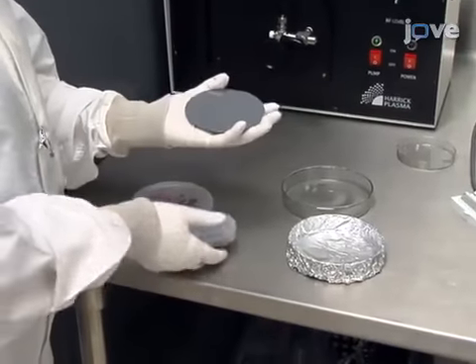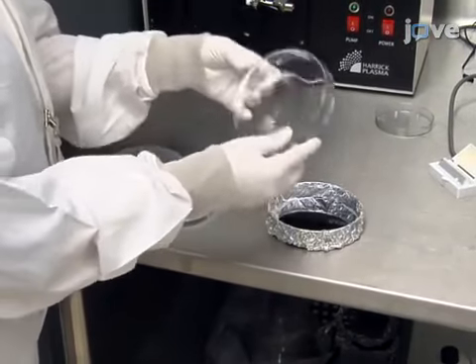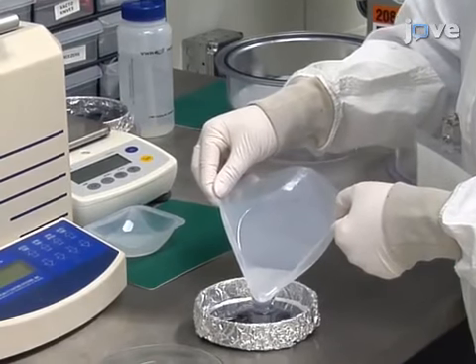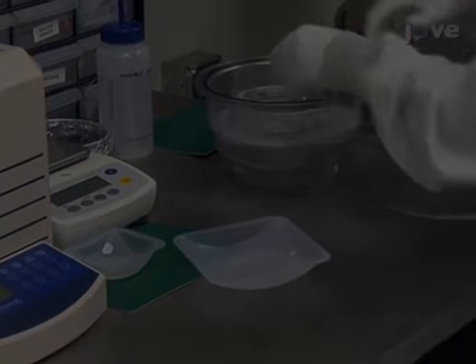While degassing, place the control valve master mold into a glass container. Pour the degassed 5:1 PDMS mixture onto the control valve mold. Transfer the glass container into the vacuum desiccator and degas.